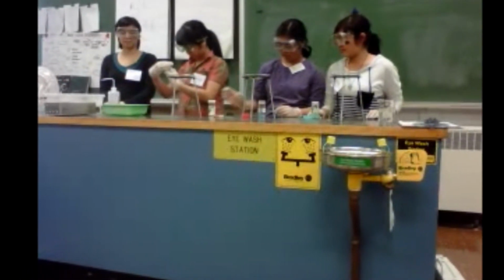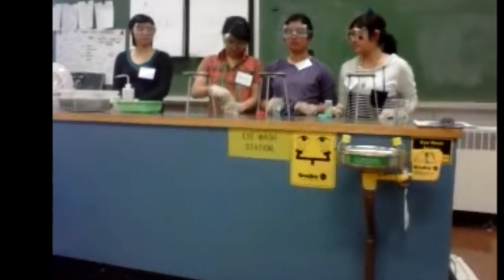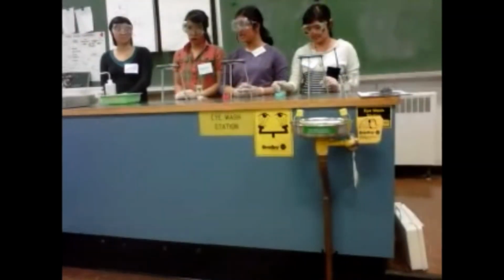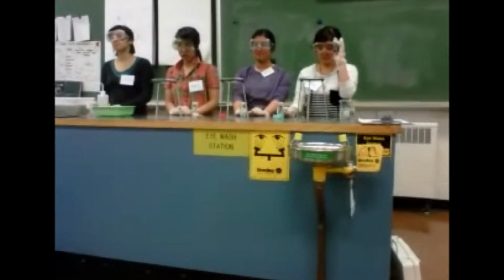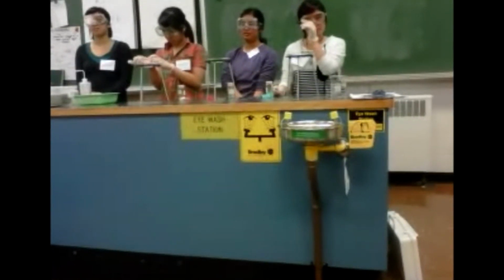Okay. We'll make sure that we have one that has holes on it, so it looks like a small shaker. Okay. I need you to just tap it on the table. Great. So right now, this looks absolutely awesome. Now my MCs have to say a special word, or they actually have to give Josh a cue, like, Josh, can you turn off the light? So I don't know who's the MC for the colored flames.